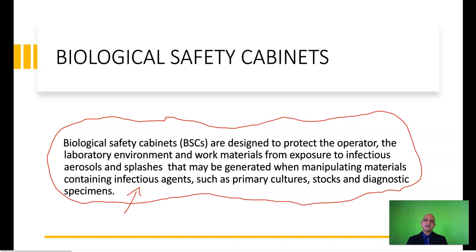What a biological safety cabinet offers to you is a safe working space. However, in order to utilize a biological safety cabinet, one has to take into account certain precautions such as the administrative controls and standard operating procedures.